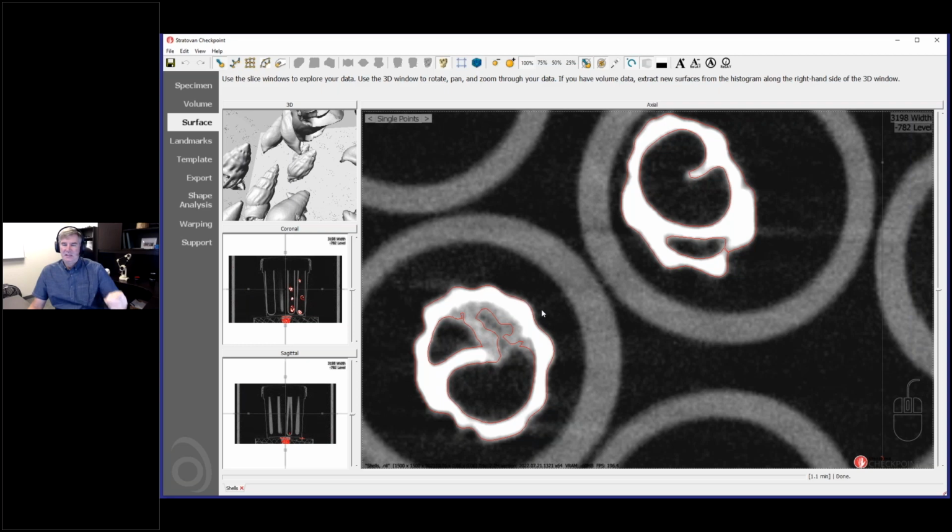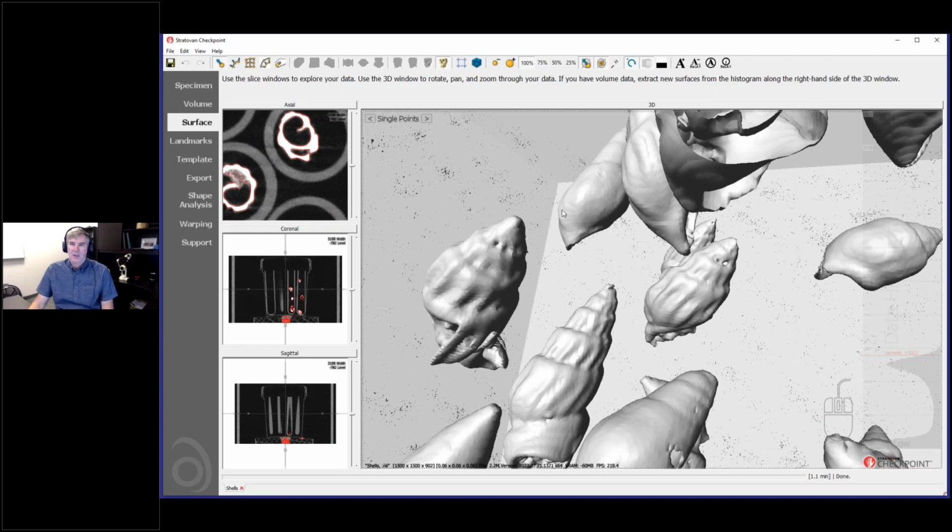An isosurface is effectively the surface in 3D that represents a specific density value. So if you think of a contour map, a topography map of height, and you have the contour lines, those contour lines are an iso line at a particular height, and that's what this is represented in 3D. In 3D, instead of a line, you have a surface. And so that's where we get the triangle surface from here. This surface represents the exact same density value throughout the volume.